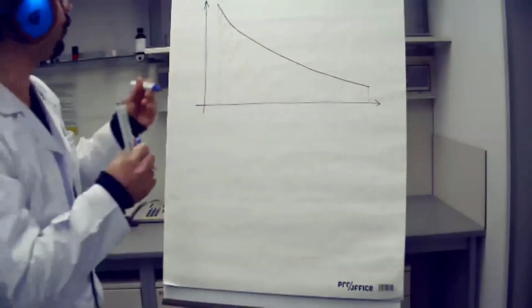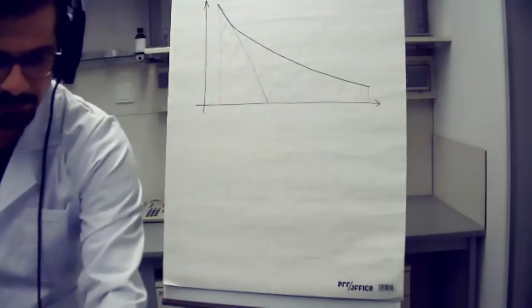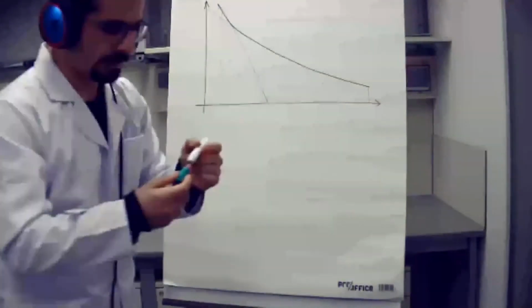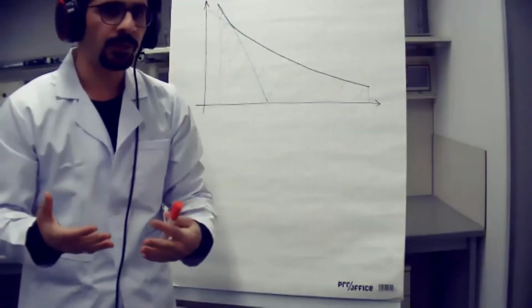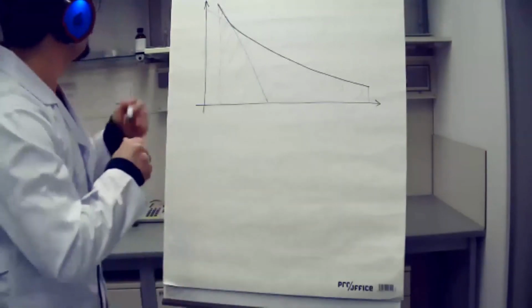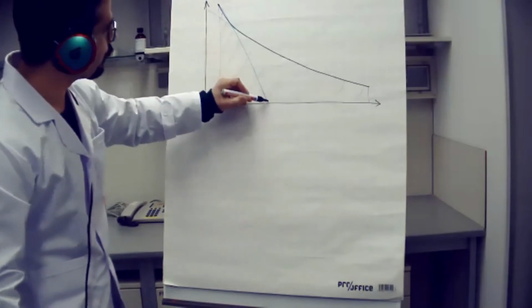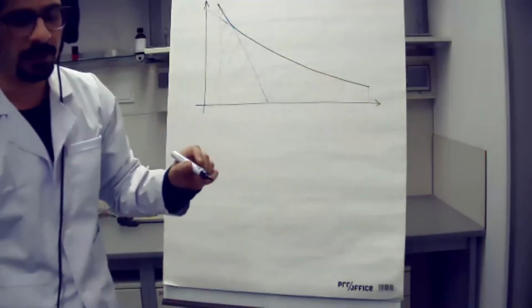And when we have 2 components, for instance, a short one, which would decay like this, and a long one, which would decay like this. What I understand regarding that is the difference between amplitudes for the different components, short lifetime component and long lifetime component, if I do the fitting. So that would be the decay curve for the short component, and that would resemble the decay curve for the long lifetime component.